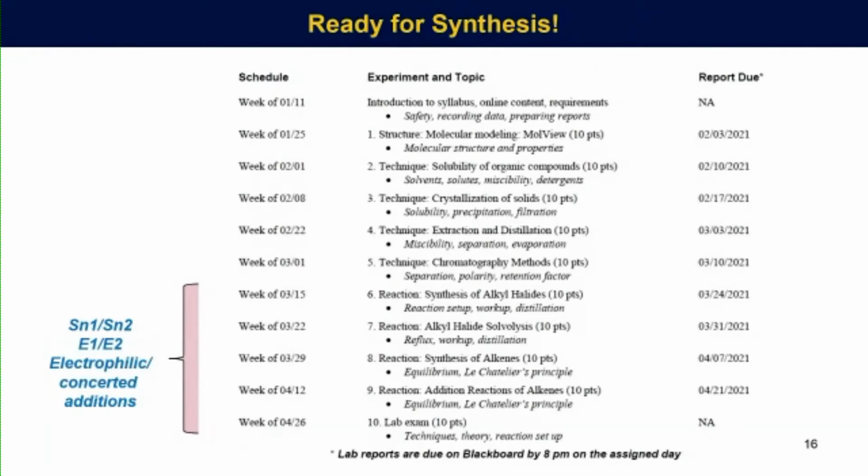And this was a great experience because the students had to think. We did some directed reactions where we said, go do this, and what do you see?